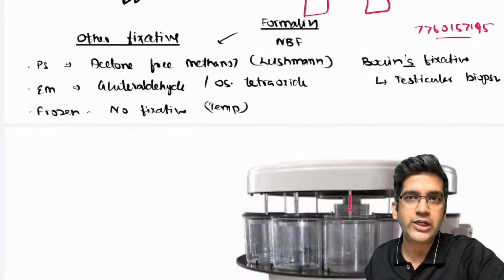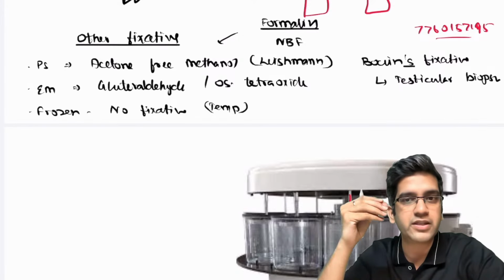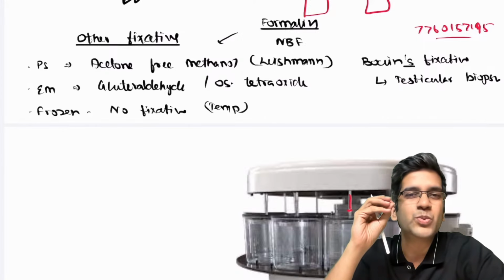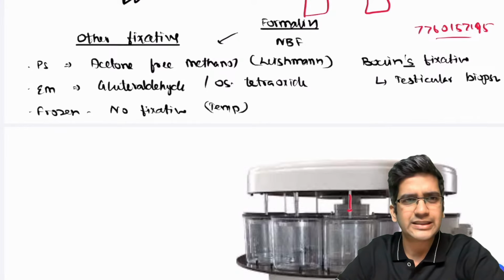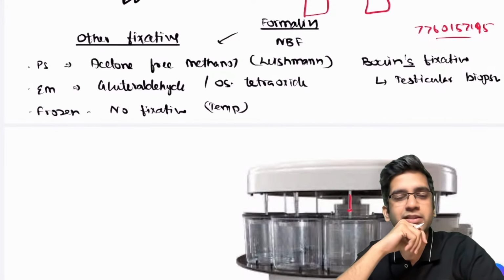So now I told you one of the basic problems why I need this processing to happen is the normal biopsy is a little bit softer. I cannot cut something into 4-5 micron thickness when it's softer, right? So can I say I should make it harder? Yes, by default, I have to make it harder. How do you make it harder?